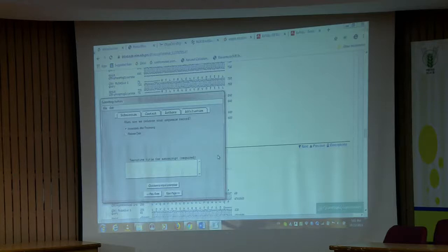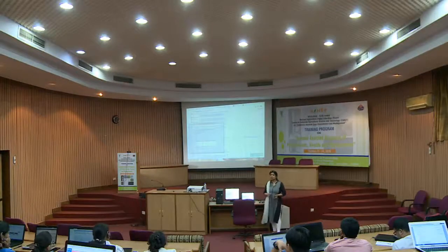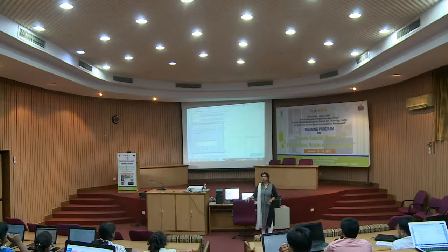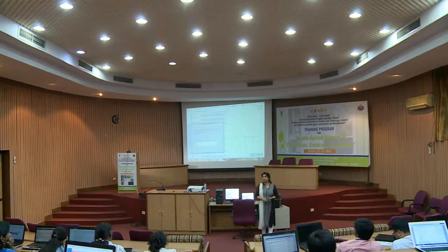So I assume everything is clear. You just write down these softwares and practice it once. You can start with one or two genes, pick any sequence online, and try to make it up to a flat file. Wherever you face any problem, you can get back to us. But try it once, and try it today only, otherwise you will forget, because there are multiple softwares and multiple steps. If you have not written it stepwise, then you will get stuck at some other place.